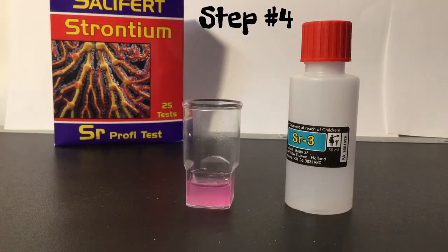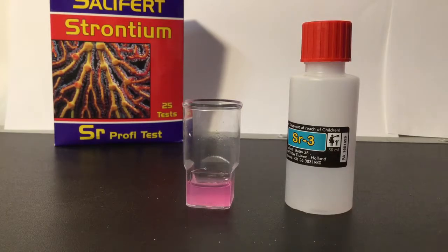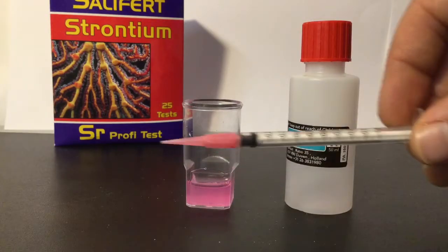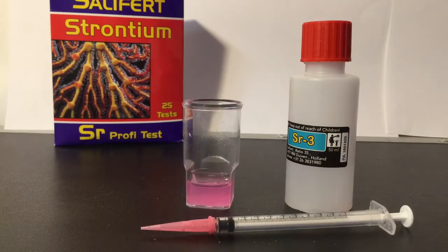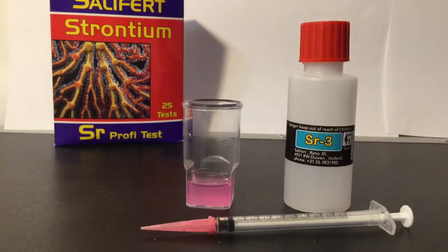Now, fill the one milliliter syringe without the red label — the one with the pink tip on it — with one milliliter of SR3. You want one milliliter in that syringe with the plastic pink tip. Then you dose that whole one milliliter of SR3 into the vial and swirl gently for 20 seconds.